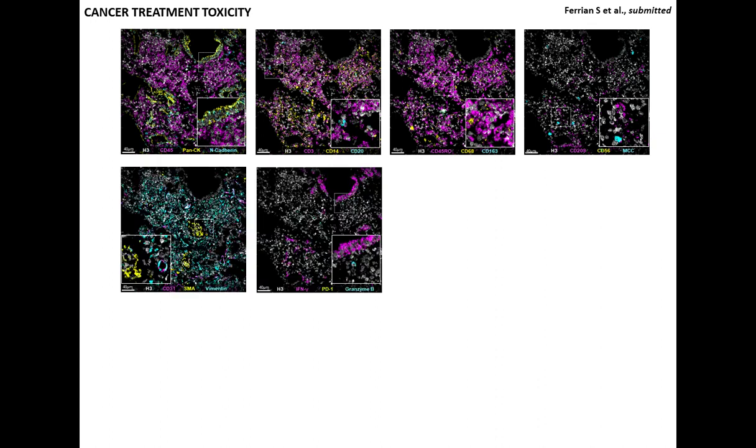In addition, we found moderate levels of CD31 cells in the lamina propria, highlighting a significant degree of vascularity across the gastric mucosa. On the other hand, epithelial cells, highlighted in yellow on the first figure on the left, displayed consistently elevated interferon gamma expression throughout the region, which may be a potential contributor to the observed gastritis.